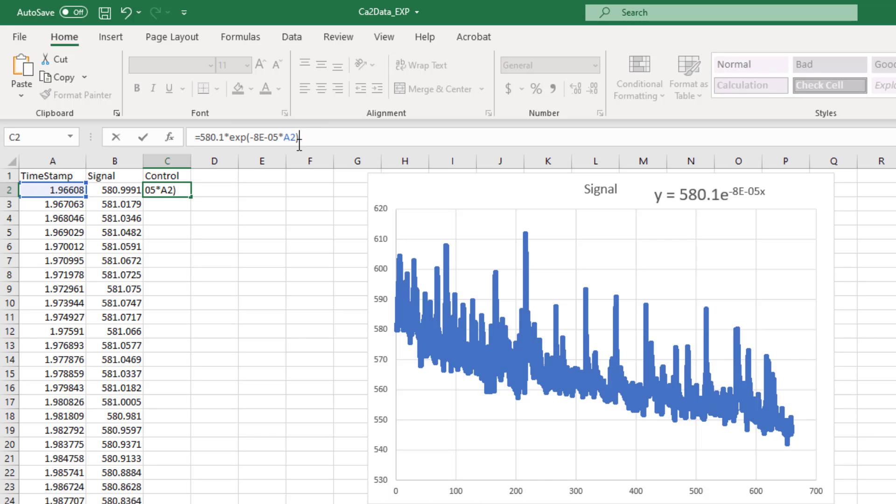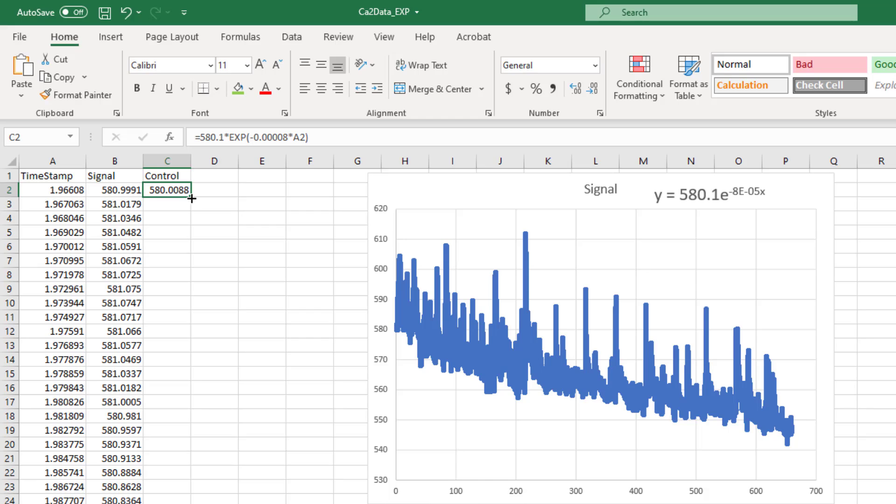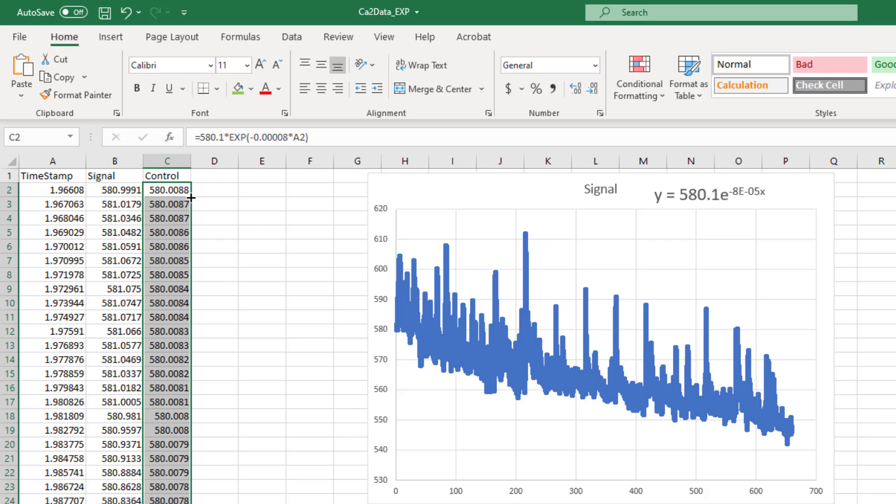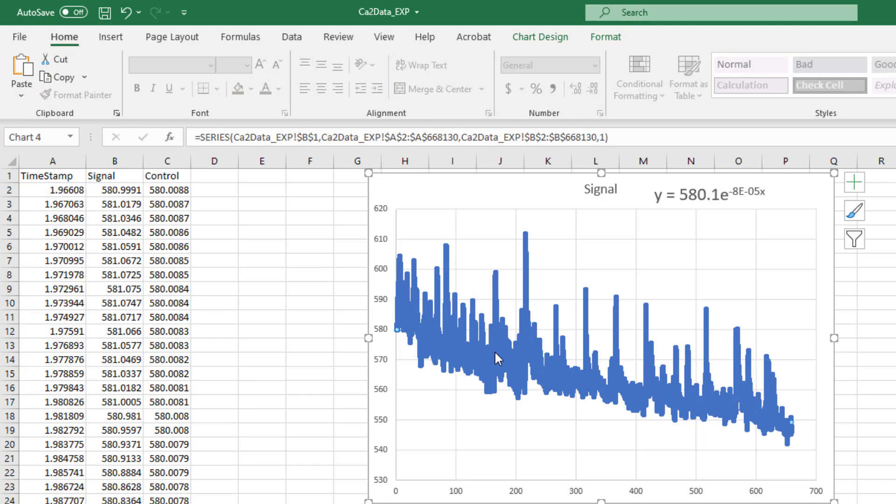We're going to do this just for the first cell, and what that will allow us to do is to get this first predicted data point. So you can see we've now created a predicted Y value for what the data should look like here if we're following this curve. Then we want to carry this down for all of the data, so you can either click on this corner square and drag, or if you just double-click it'll carry it all the way down to the bottom and you don't have to worry about doing that manually.